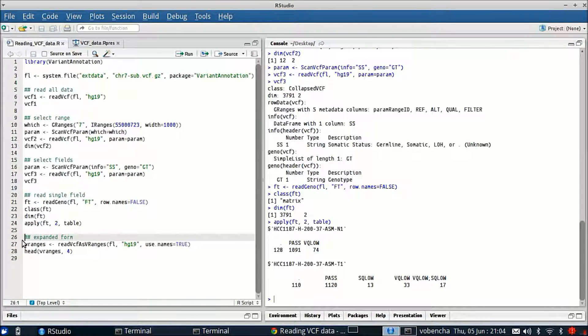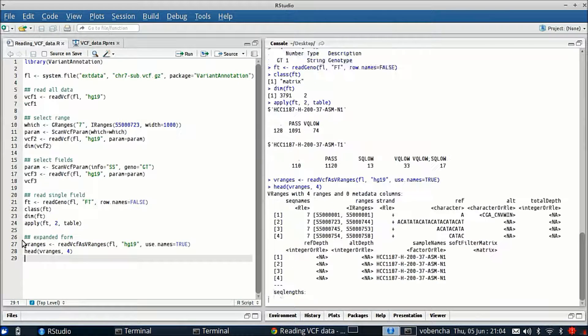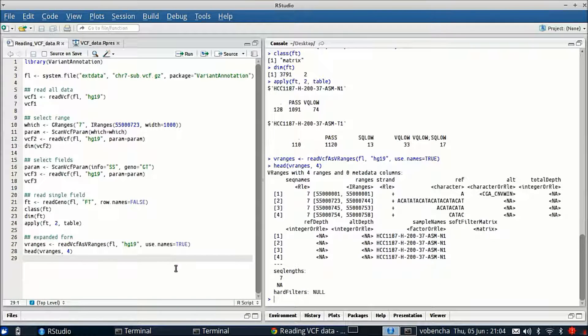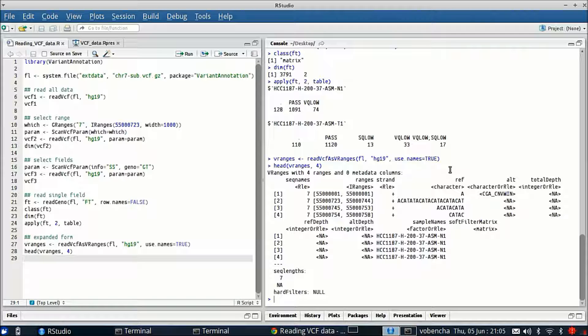The last thing I wanted to show you is reading data into VRanges with ReadVCF as VRanges. You can see this looks a lot like a GRanges object. It's got our ranges here and then it has our metadata columns over here. By default this function only reads in the AD, the allelic depth genotype variable, and all of the fixed fields.